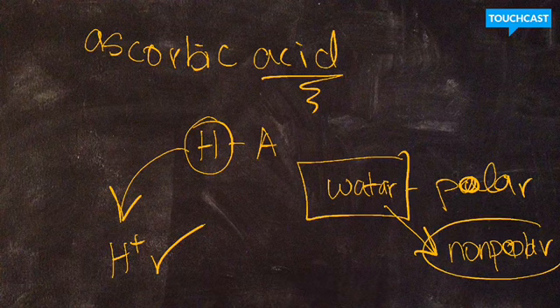substance. The next one that we want to talk about are the dyes. And the pre-lab did talk pretty much mostly about those dyes. And the reason why we can separate out the dyes so well is because they are moderately polar. I think you're going to be able to tell through the lab who has a higher polarity and who has a slightly less polarity. It'll be actually pretty cool. So we're going to classify those dyes as being intermediate in polarity.